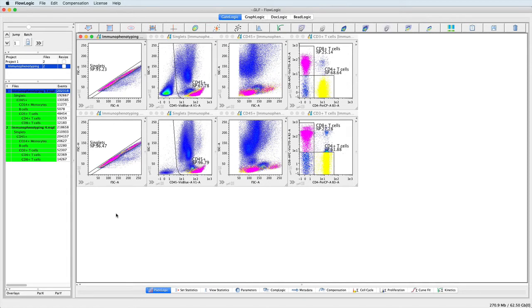In FlowLogic, once an analysis has been created, it can be saved in one of two different file formats: a .glf or a .GateLogicExperiment file.